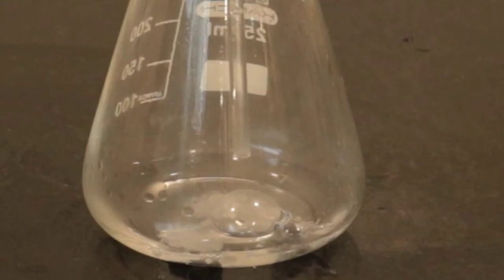And we know that there are many gases that are odorless and colorless, like oxygen, carbon dioxide, or nitrogen. All of these gases are around us in the atmosphere, right? And these are also colorless and odorless. So how do we experimentally verify that this gas is hydrogen gas? For this, we are going to perform a test, the pop sound test.